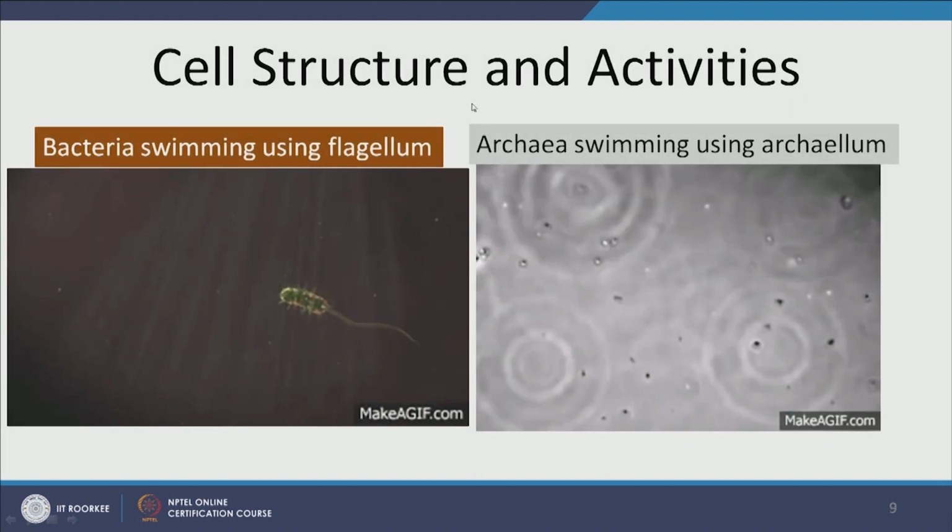Alrighty. So using all these microscopes, the ones that are high-end and used in lab, and the others that hold promise for real life applications, we get insight into microbial communities and their behavior. On the left, we have an image that was captured and given false colors of bacteria swimming using their flagellum.